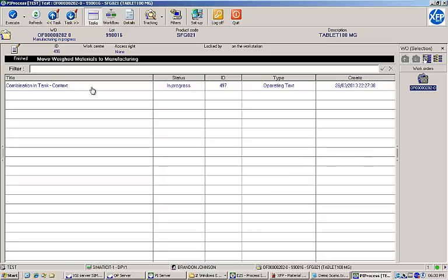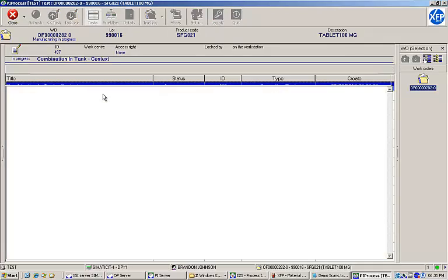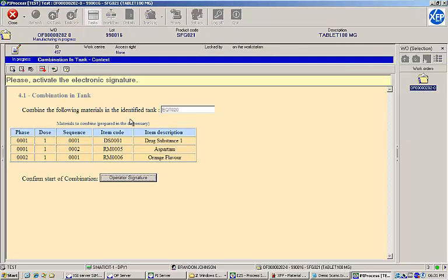Now that we've weighed our materials, identified our tank, and moved everything to our manufacturing location, it's time to combine the materials into the tank. This task gives us the context details of this combination operation. It lists the tank that we identified earlier, along with all of the materials in our bomb, and asks us to begin combining them.